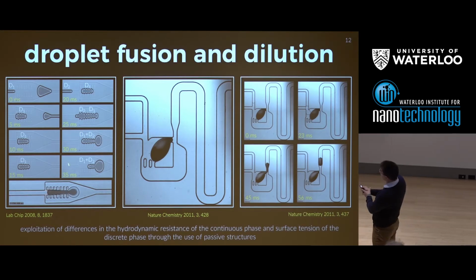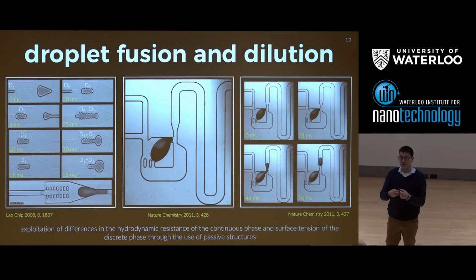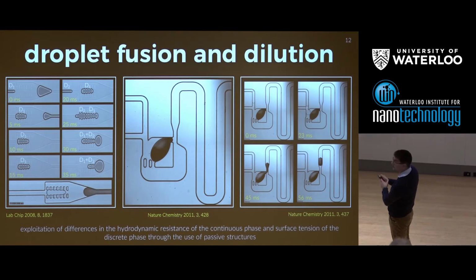So what happens, and you can see this if you go through the images above, is that our droplet comes along, it effectively slows down and becomes pseudo-stationary here because the continuous phase is flowing around it. It waits for a secondary droplet, so it sits here, the secondary droplet comes in, and by draining the continuous phase between the 2 droplets and destabilizing that interface, we then generate our merged droplet. You can see the internal mixing, and the droplet moves downstream.